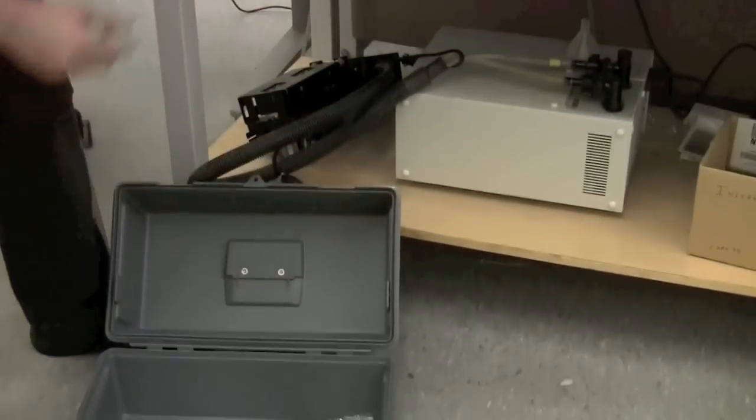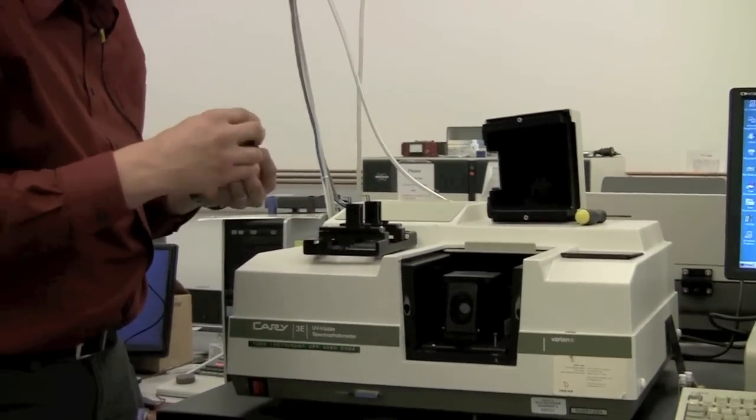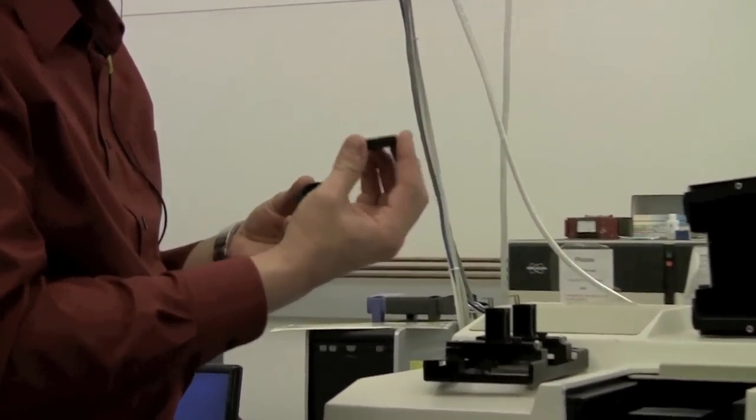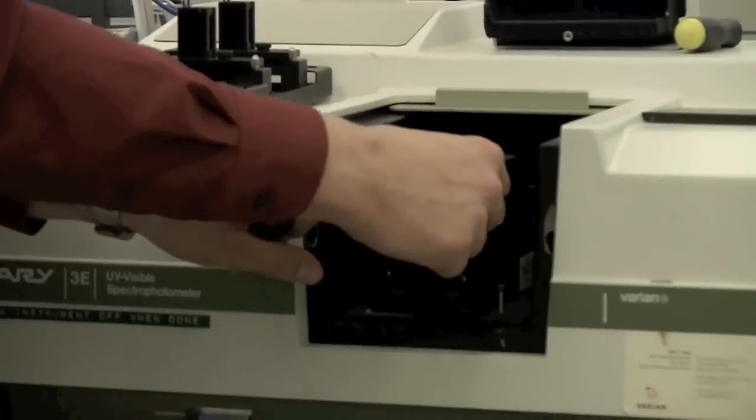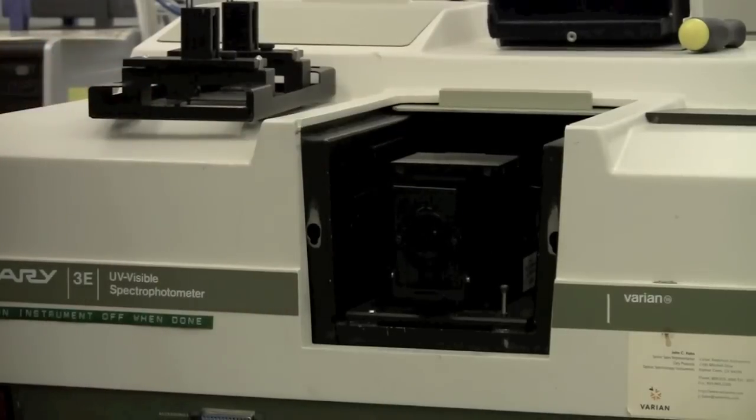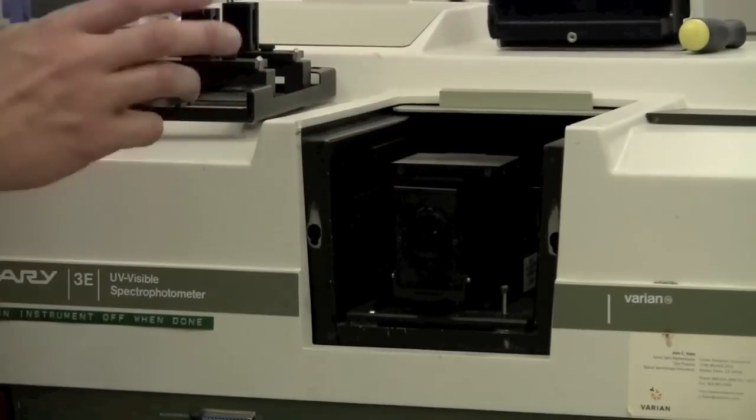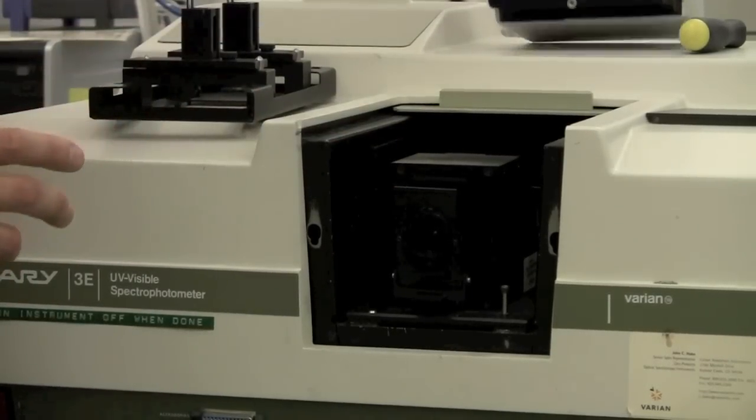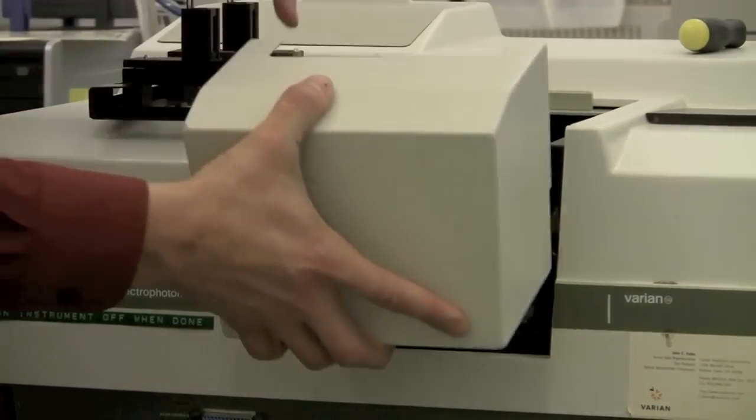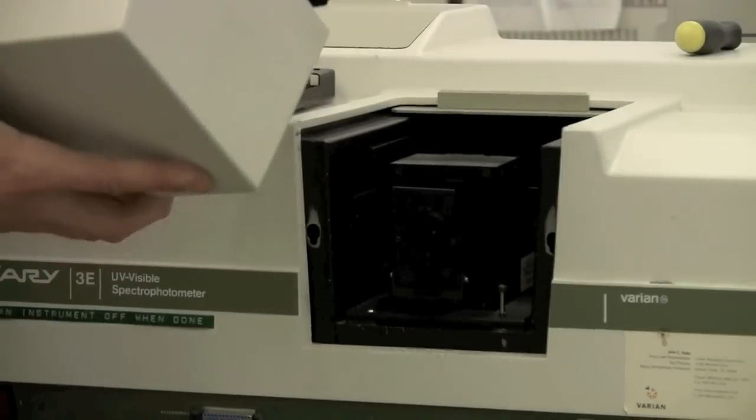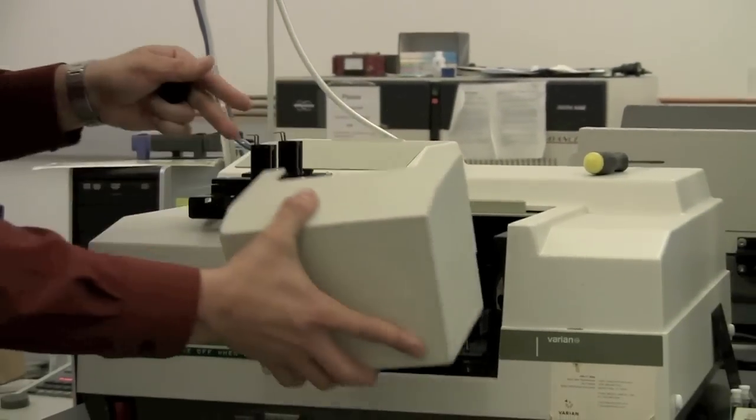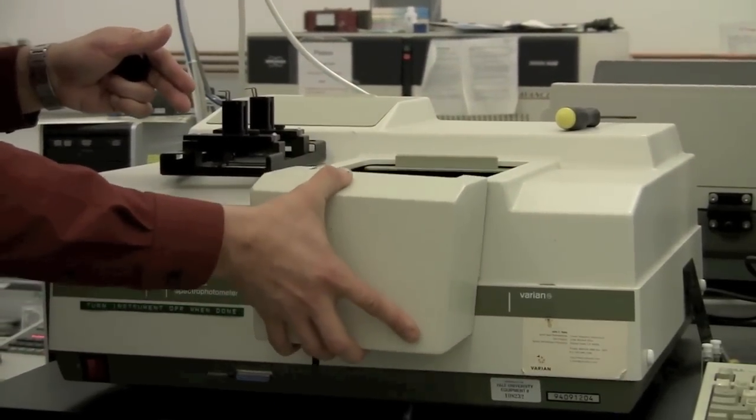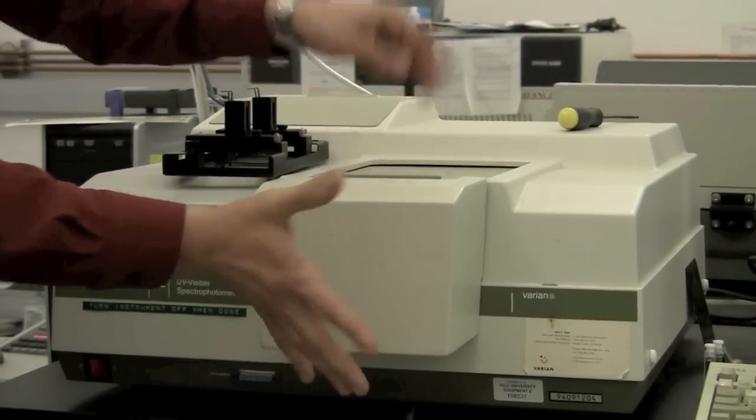If you need to zero it, there is a puck here. This puck is supposed to be pure white, and it would get clamped in here to do zero. And, of course, remember that you need to have the straight light blocked as you're doing the experiment like that.